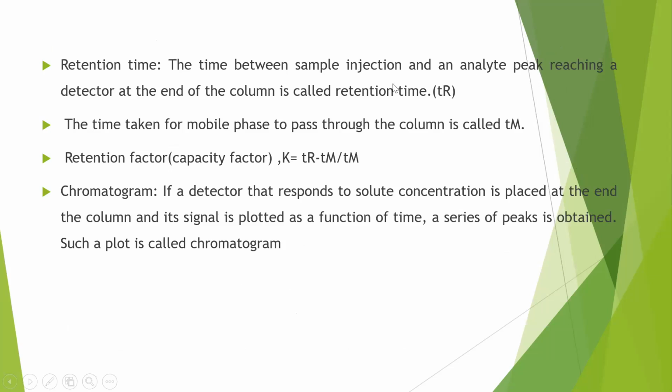Retention time, the time between sample injection and detection, is known as retention time. Retention factor or capacity factor. This is important for solving numericals. Retention factor, the formula is TR minus TM divided by TM.